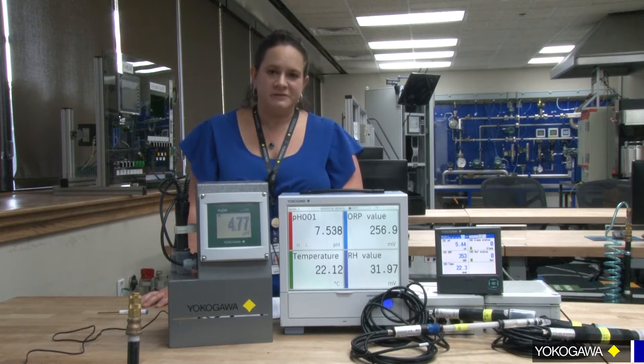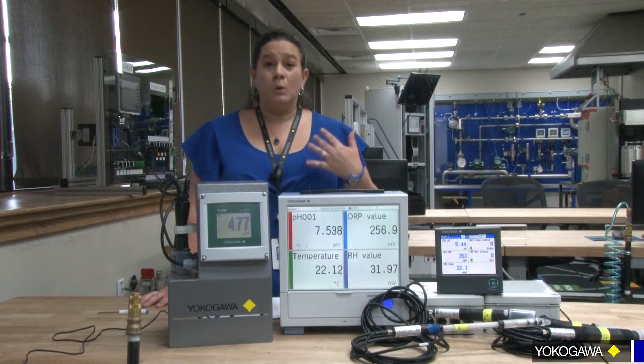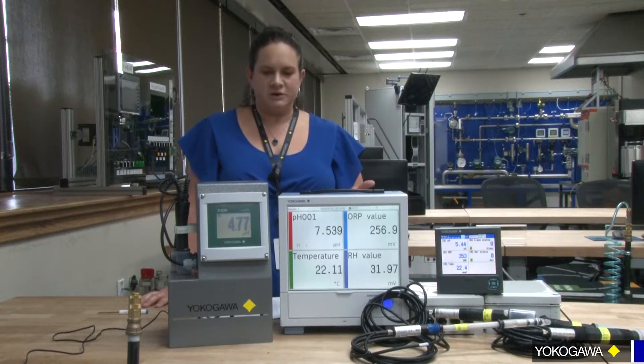Hello, my name is Sherrilyn and I work here at Yokogawa with our liquid analytical products. Today, I wanted to talk to you about some of the features and benefits digital sensors, or what we call our CENCOM sensors, have to offer to customers and end users in general.